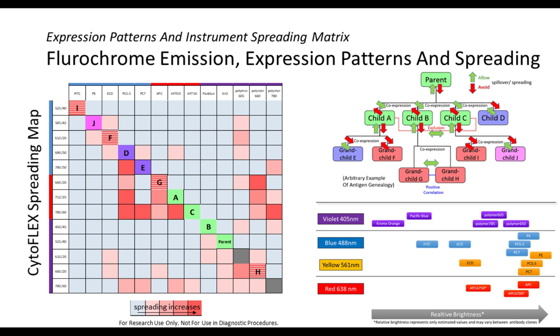But I think it is important also to understand a little bit better what is behind this spreading matrix. And for this, I would like to hand over to you, Maria. Thanks, Michael. I really enjoy seeing all of these concepts come together in a graphical way. What great tools, right, for when you're designing a panel and you can actually understand the instrument and how the instrument can either help you or things that you may need to accommodate for. And so let's get moving into that topic of what the instrument contributes and some considerations that you can make that might help you with your panel design.